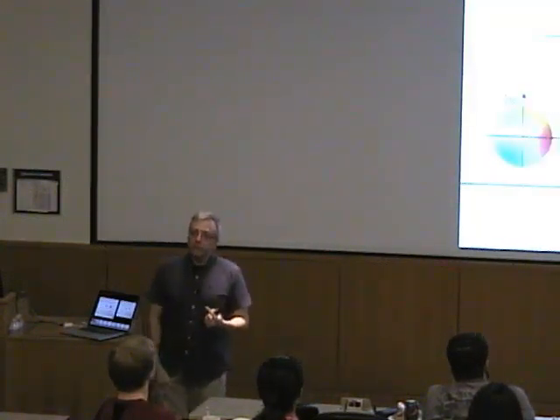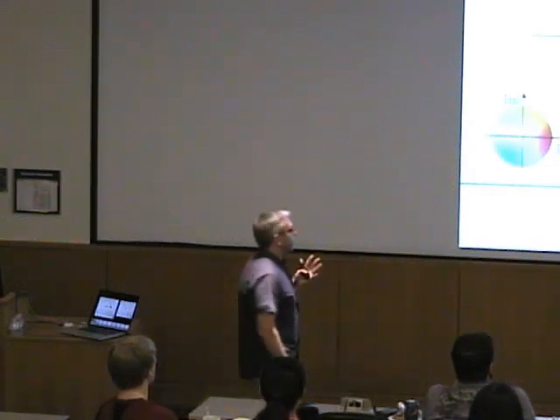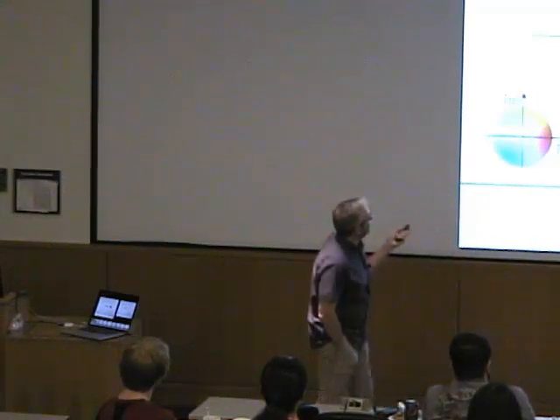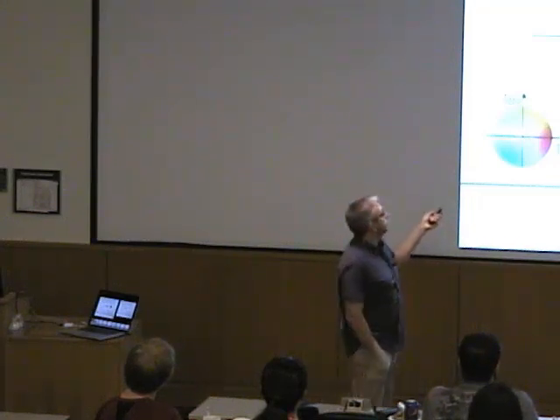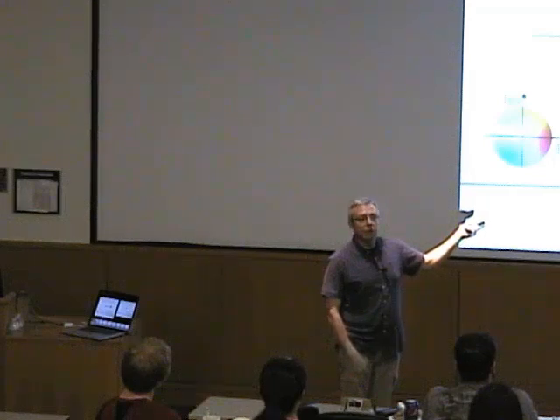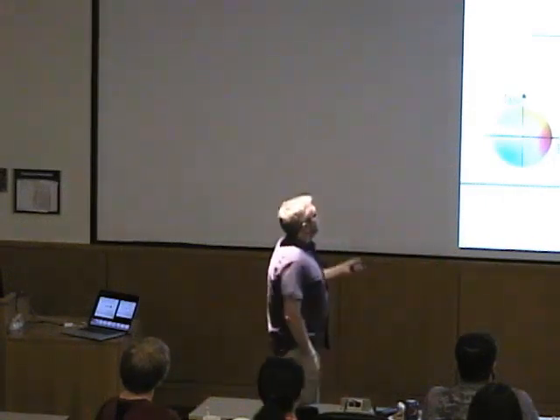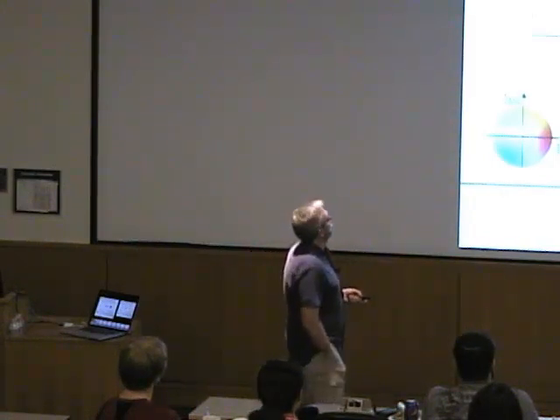Now, the Fourier transform is a pretty neat thing. And if you look at what it does, it's actually kind of instructive to see what's happening in a diffraction process. Now, if you have one single atom, and you Fourier transform that atom, this has the shape of a Gaussian, and this still has the shape of a Gaussian. It goes forward and backward, that is all pretty much the same. The atom is a bit fuzzy, and the Gaussian is also a bit fuzzy. That's what it is.